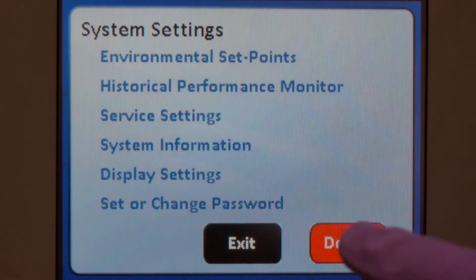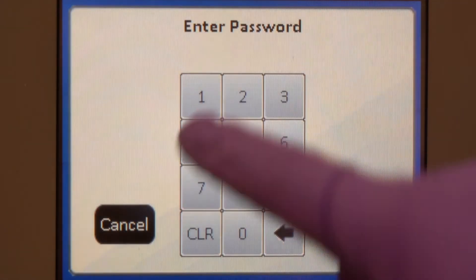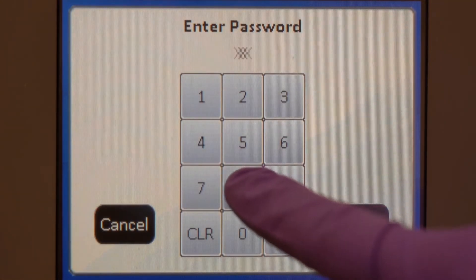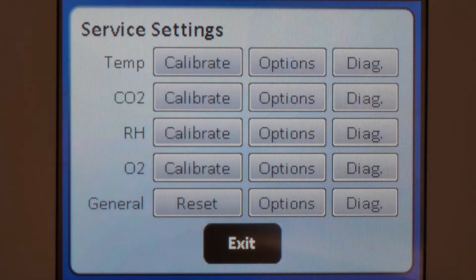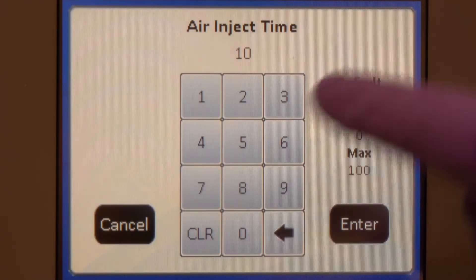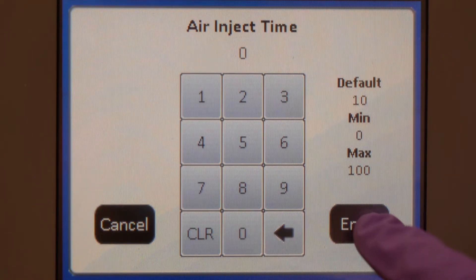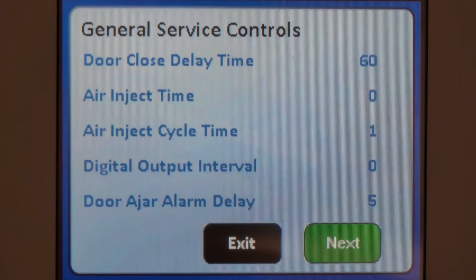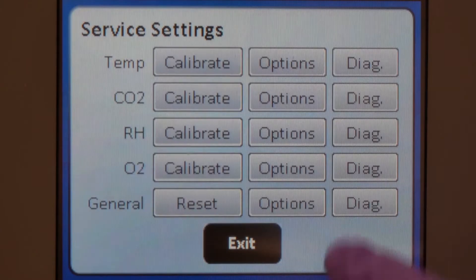Remember to save when you're done. Enter the Service Settings menu to reach General Options and set the Air Inject Time to zero. Remember to save when you're done.